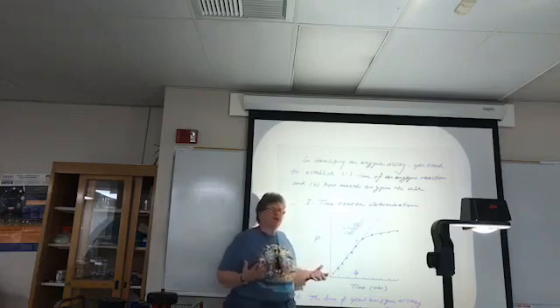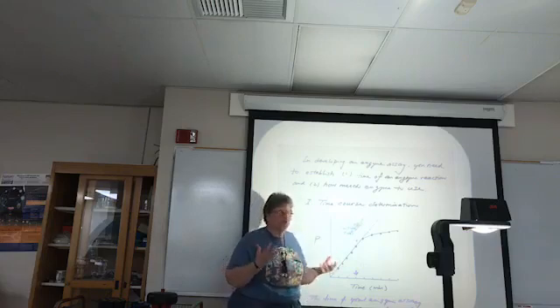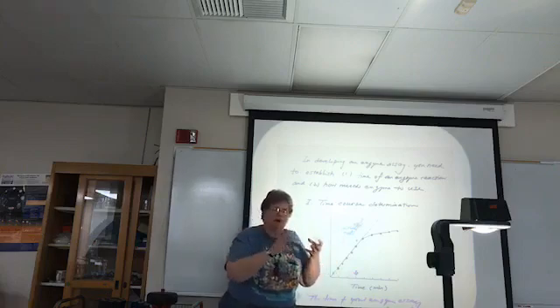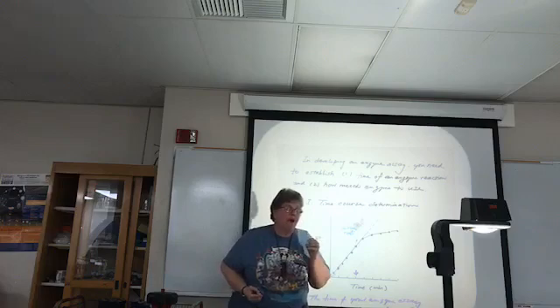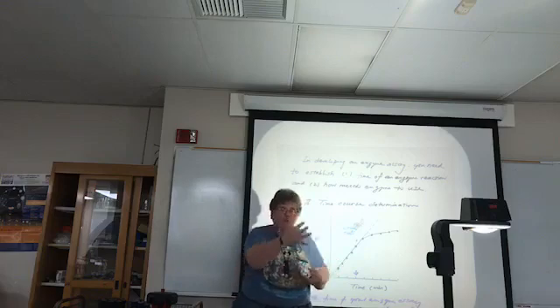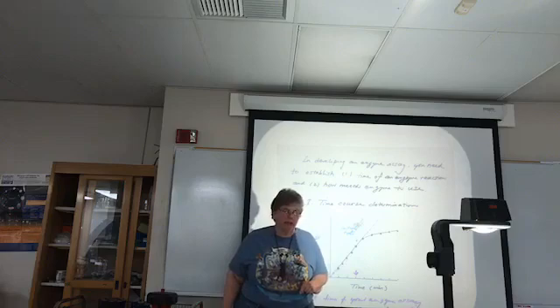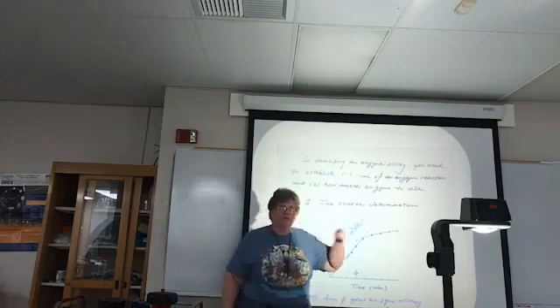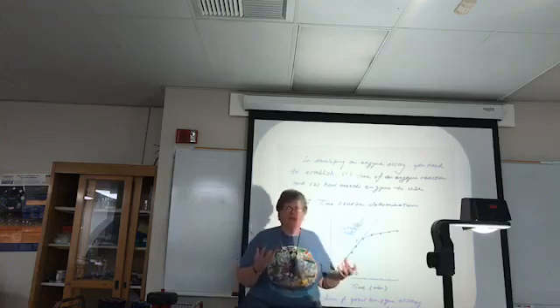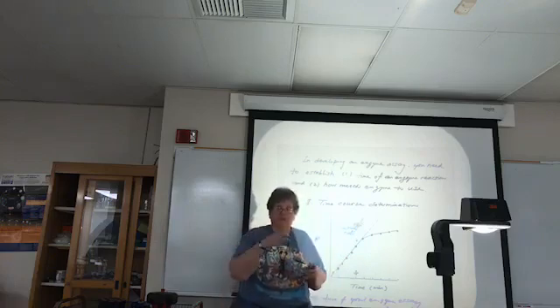So the first thing you're doing is mixing together your substrates with the enzyme. So you're mixing together the pyruvate plus the NADH, and a certain amount of buffer to keep the pH steady. You need to have buffer in there to keep the pH steady, because remember, the reaction is taking hydrogens to add across that carbonyl carbon. So if you did not have any buffer at all in the reaction, then you'd be changing the pH of your solution, and pretty soon you would not be in a good pH range for optimum pH to do your rate of reaction at all.